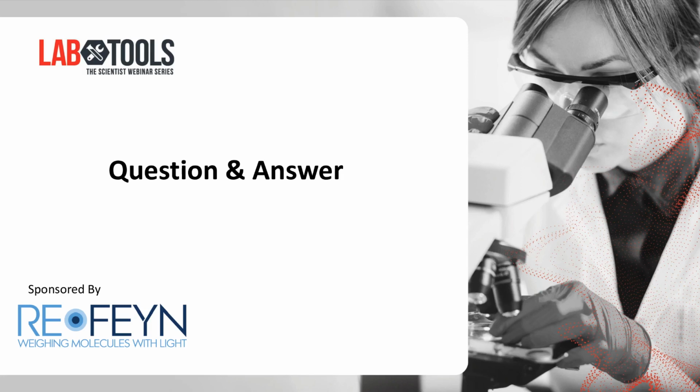Yeah, that's a good question. So I'll first answer that by saying we actually compared the glycan masses that we got with bottom-up glycoproteomic data, so the gold standard method, and those numbers actually match up quite well. We haven't tried deglycosylating the spike trimer, mostly because those deglycosylated constructs tend to be quite unstable. So experimentally, that's quite hard to do. But we don't really expect any biases because we've measured many other proteins within that mass range. So we don't think mass calibration's an issue. But I hope that answers the question.